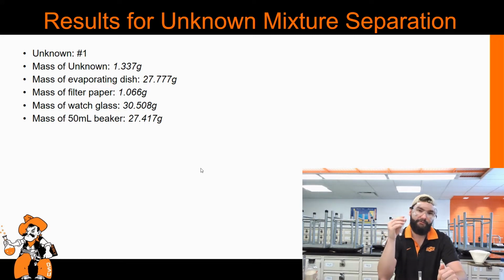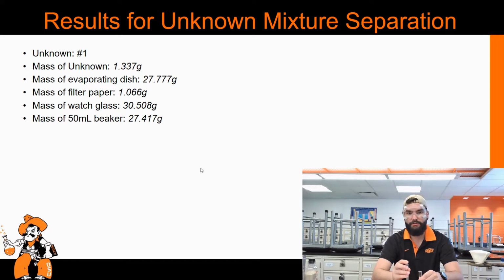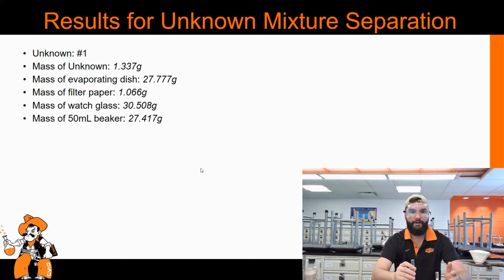We're going to then carefully pour off the water layer into a separate test tube. We will go ahead and rinse that unknown like that 3 more times to make sure we get all of the salt and all of the silt out of the unknown. So after our rinsings, we should have just sand left in this test tube and salt and silt in this test tube. Then we can pour the salt and silt through the filter and separate off the silt.